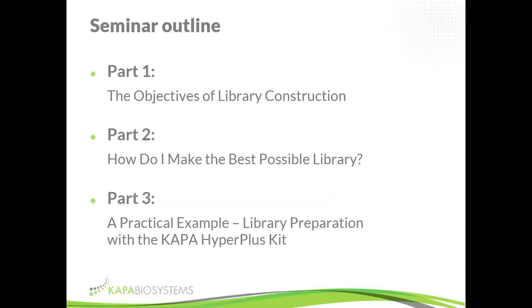In part two, we'll start digging into more of the practice of it and looking at different library construction parameters and how to optimize each of these to make the best possible library from your available sample.